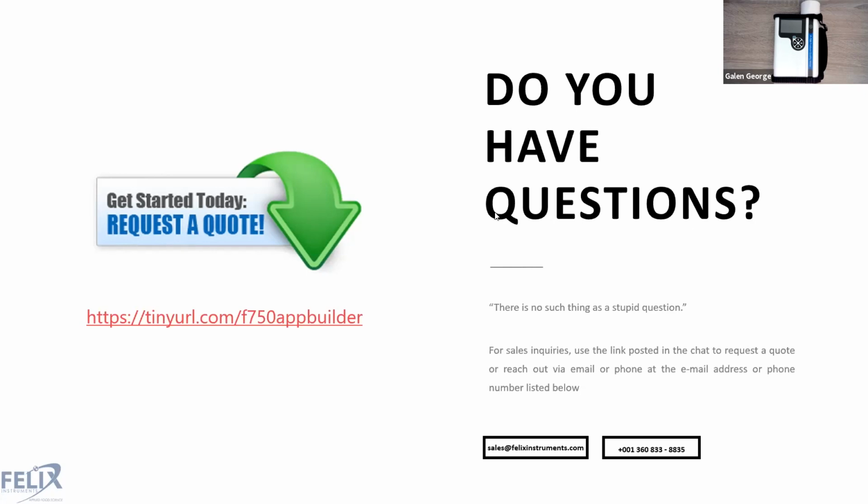The issue is going to be deploying that model back onto your system; there are probably going to be some barriers in figuring out how to integrate the models within that app onto your FOSS NIR system. But if that's something you want to do, then like I said, please reach out to us and we will be happy to help you navigate that.